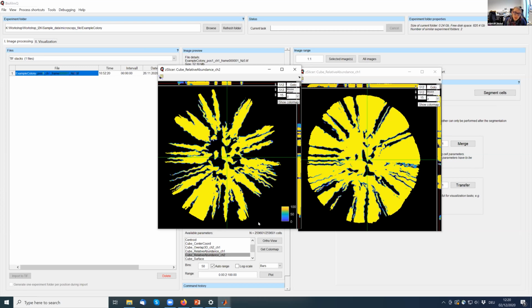The 0 itself is actually black, which is why, even though there are cubes in here which are part of the segmentation, they are completely black, because the percentage of filling with this other color is 0, or the abundance of channel 2 is 0.